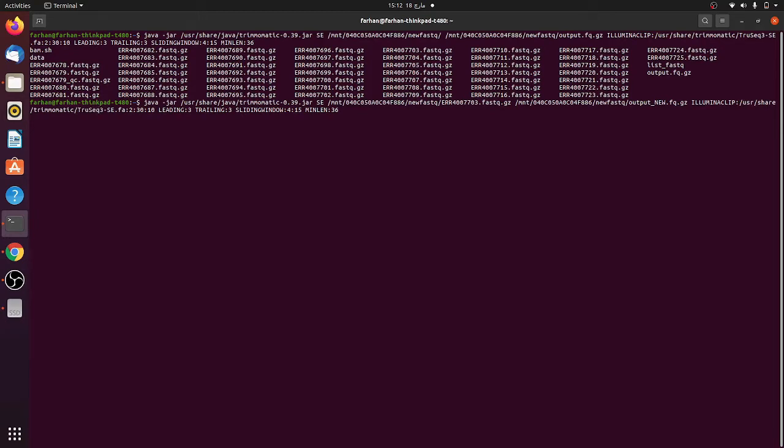Then this is the TruSeq3-SE.fa FASTA file. Here the adapter sequences are present in this file and you can actually trim those. If the adapter sequences are present in this file it will trim or clip these sequences.